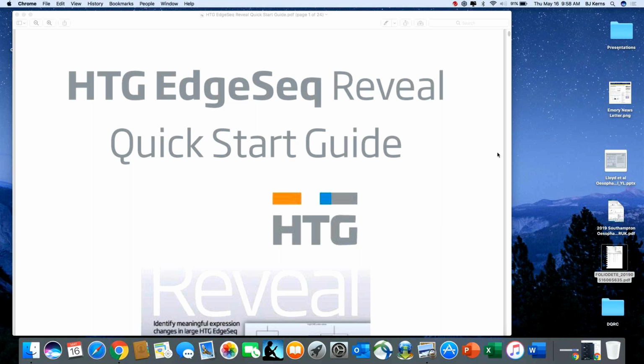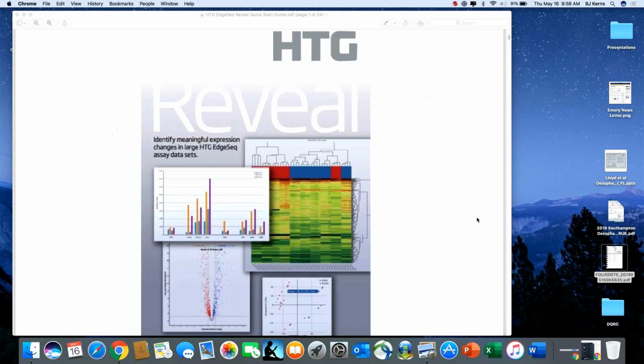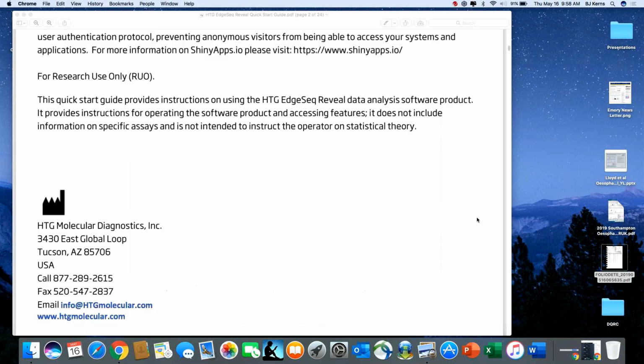I'm showing you right now the quick start guide, and this is a guide that you can get from both your sales representative or from your technical support folks that you're working with regarding the HTG products. In this start guide, it's actually going to walk you through pretty much what I'm going to show you today. It's just going to be in words and in pictures.